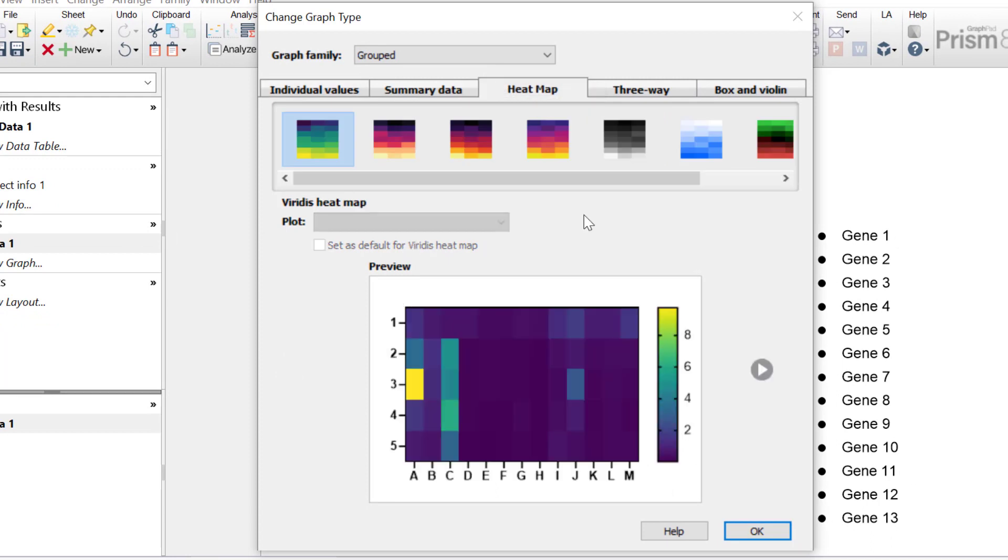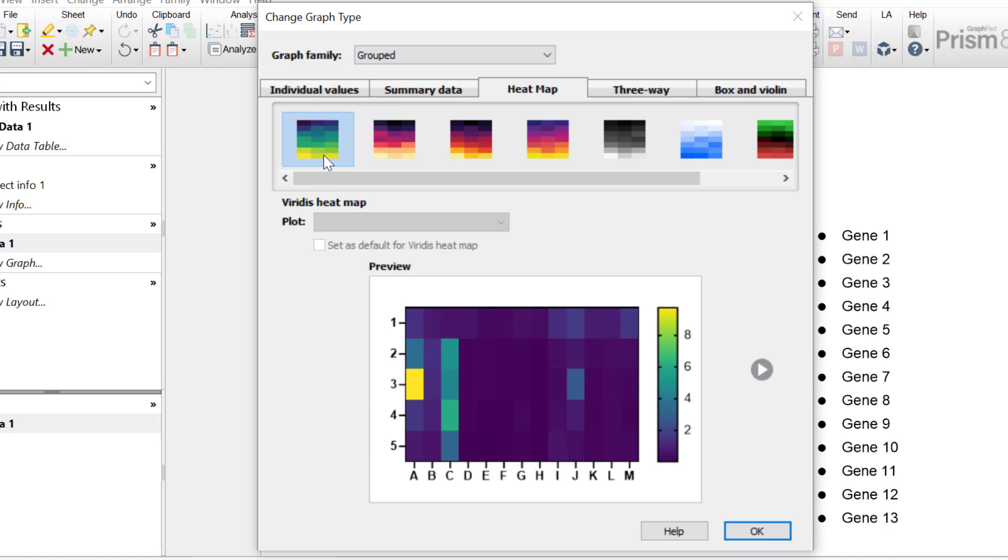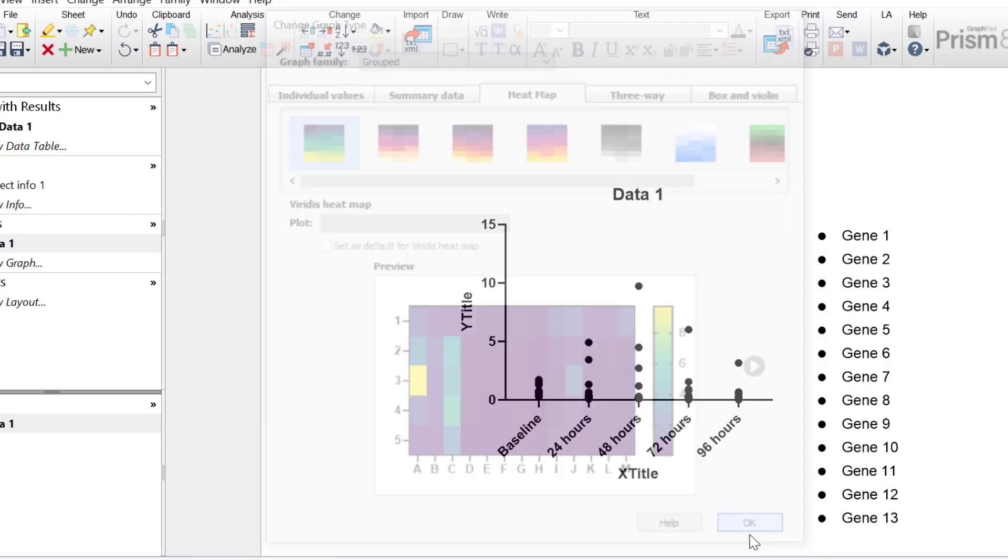I'll then go over to the heat map tab and click this. There are different heat map colour schemes to choose from. In this example, I will select the Varidis heat map, which is the first option here. The Varidis colour scheme was newly introduced in PRISM 8.4. Then I'll click the OK button.